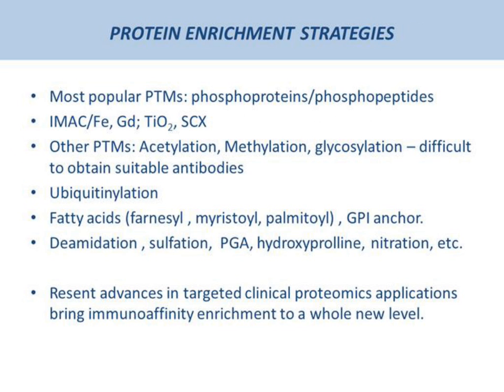IMAC enrichment, being the most popular approach, is based on phosphate affinity for immobilized metal ions chelated to the resin. Titanium dioxide chromatography is a newer technique that requires significantly less column preparation time. Strong cation exchange separates phosphorylated from non-phosphorylated peptides based on the presence of negatively charged phosphate groups. Many phosphoproteomic studies use a combination of these enrichment strategies to obtain the purest sample possible.